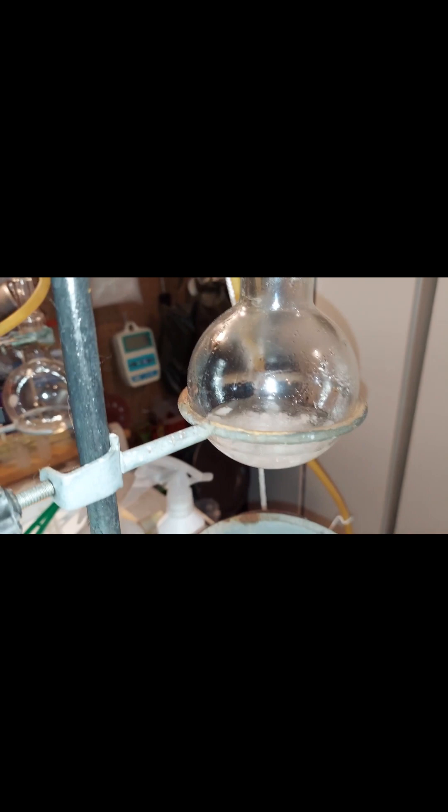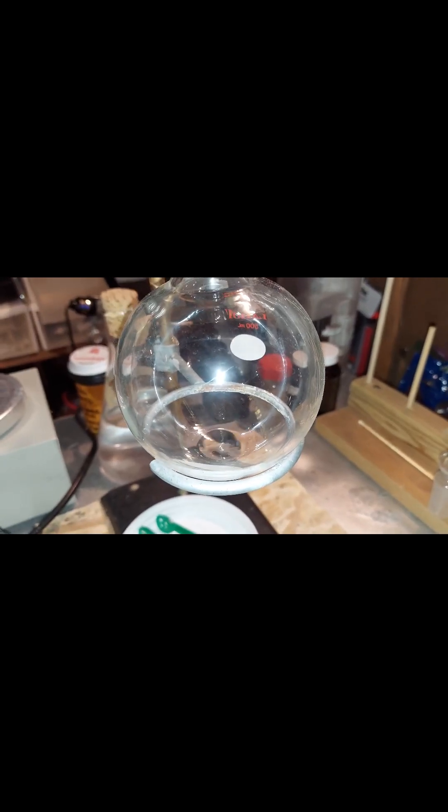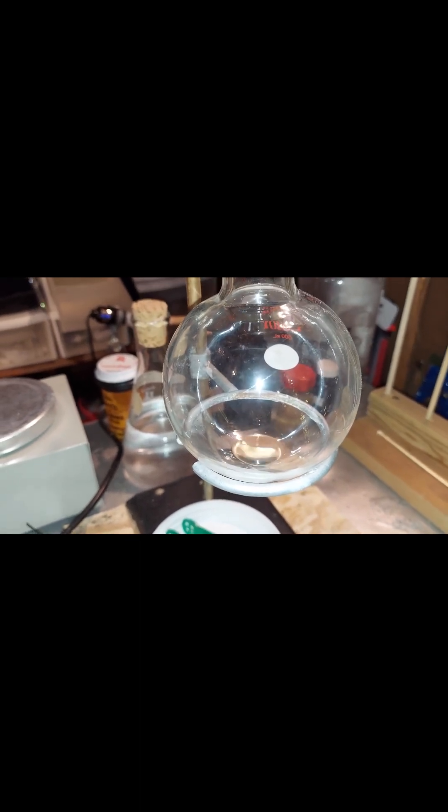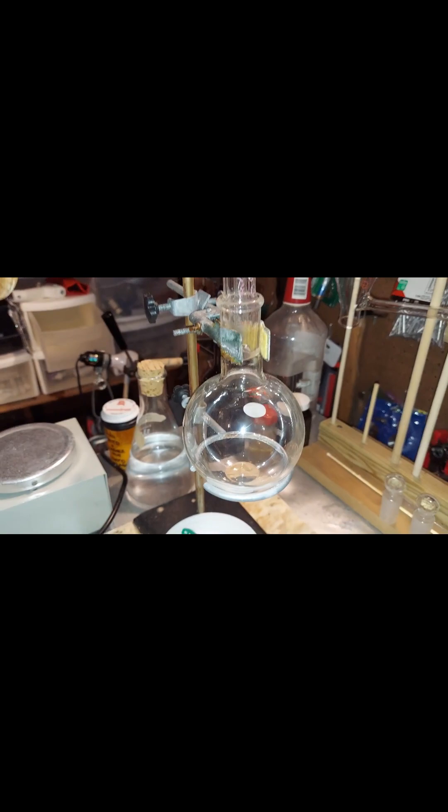We have our chloroform boiling pretty vigorously in there — it boils at about 143 degrees Fahrenheit, which is pretty low. That is probably 100% or 99.9% pure chloroform coming over on that end right there. That's our final product; I'll be putting that into that dark bottle back there.